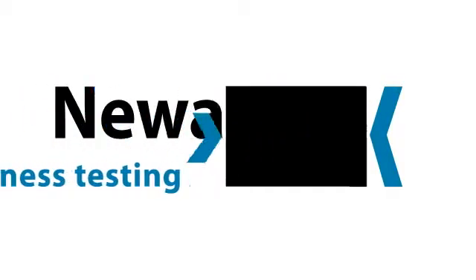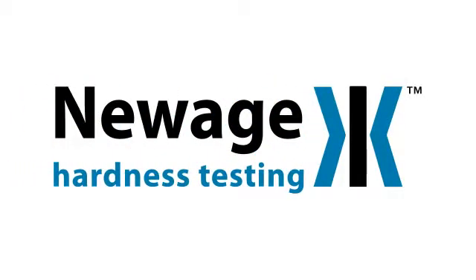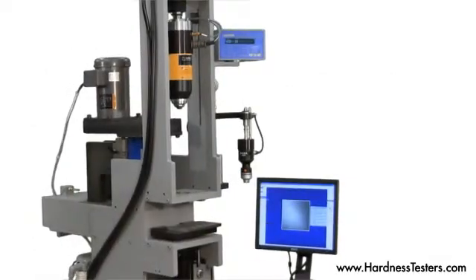This video contains a brief overview of a custom test of an inline or offline Brinell hardness testing machine. It can be designed to meet both ASTM E10 and/or ASTM E103.